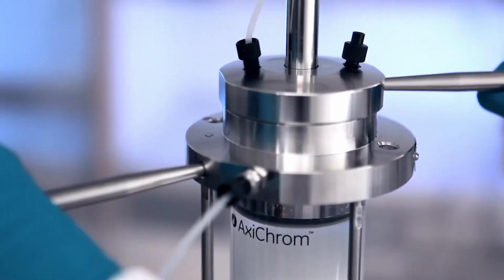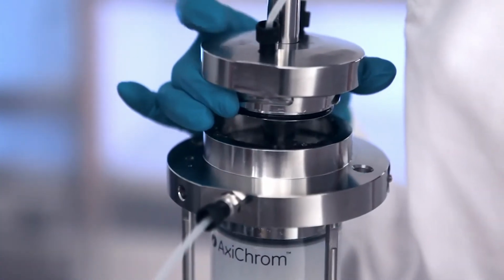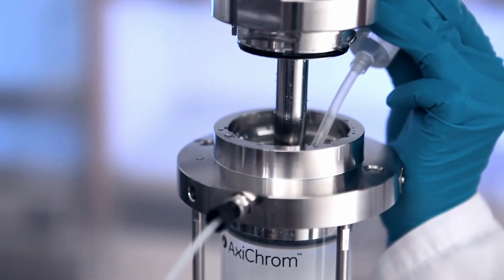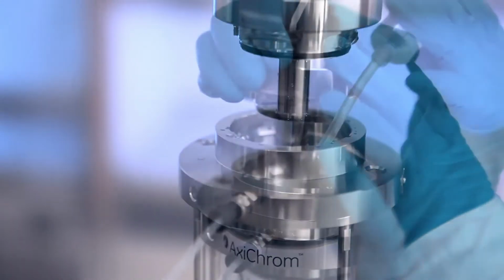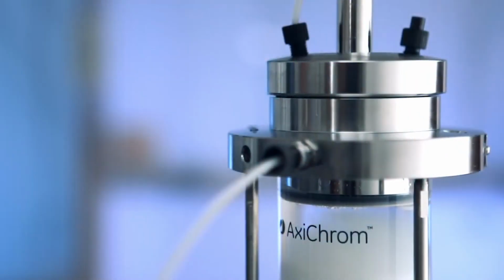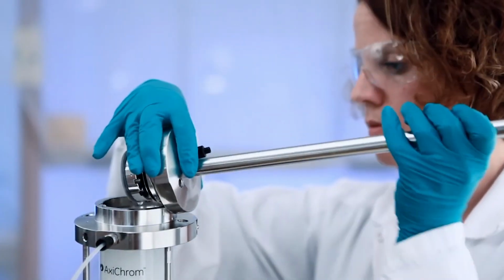The lid is opened using the bayonet fittings. Lifting the lid exposes the hydraulic chamber, allowing hydraulic liquid to be removed using a syringe. The lid is closed again, and the adapter is run to its top position. The lid can now be opened and the adapter removed.